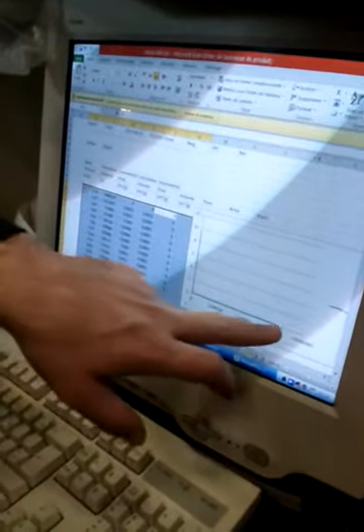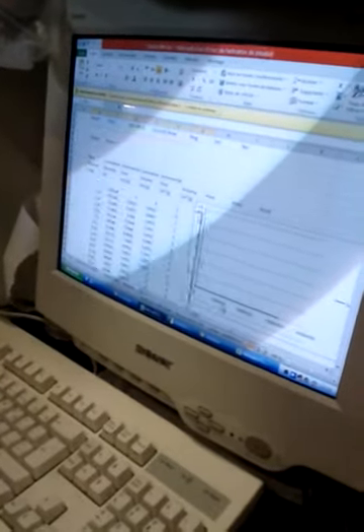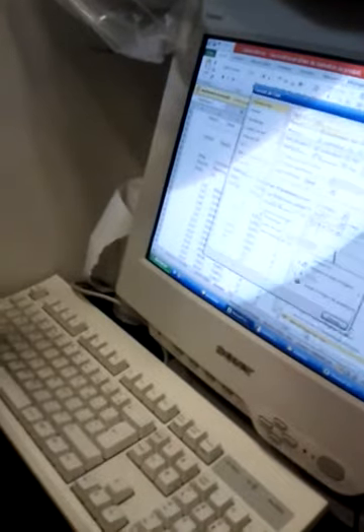We don't see anything because of the small thing. Usually we plot in a logarithmic scale. So here it's what I made. I don't remember. We are sorry. So it's a little bit strange.